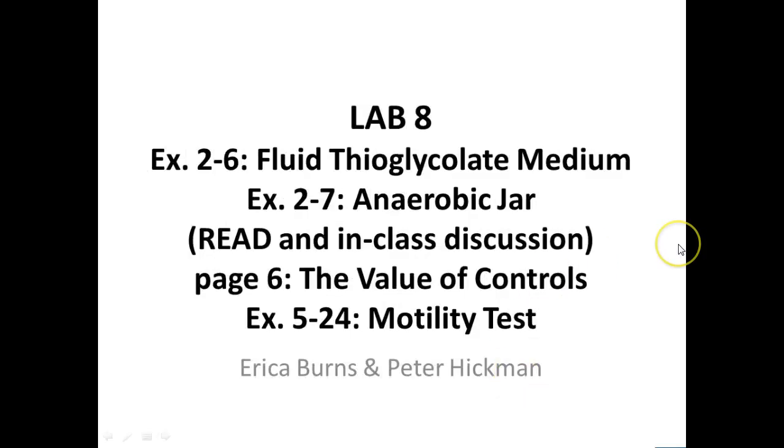So today we're actually talking about 3 different exercises. We're talking about the fluid thioglycolate media that we commonly abbreviate FTM. And these you inoculated last week. These were the tubes that I had boiling, and then I had to wait for them to cool down. They were the ones that had the little pink area at the top.